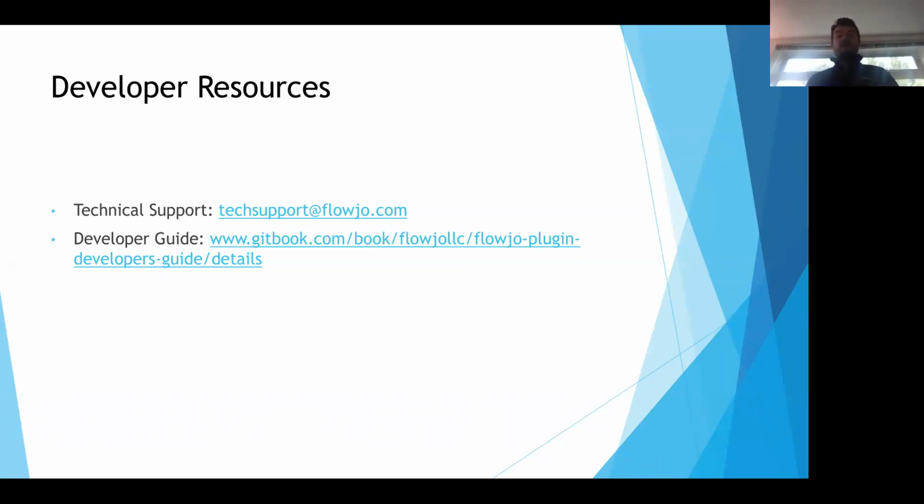And we've done quite a bit of this ourselves in tech support. So if you have questions there, and I anticipate you will, feel free to write to techsupport@flowjo.com. Even if you're not interested in packaging your tool, maybe, if your tool seems cool enough, we would be happy to help you out with that as well.